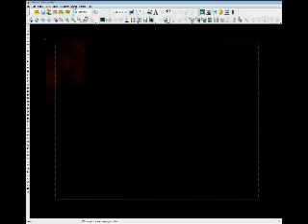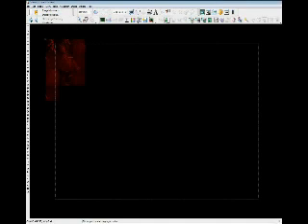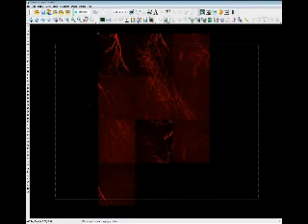We'll go to Image, Maximum Intensity Projection. Good. And now we can see all of the image stacks. Let's make that a little bit easier to see. So the first thing that happens is when we load these images using the montage tool, you can see that they're coming up in a grid pattern. This makes it easier to see what you have to work with.